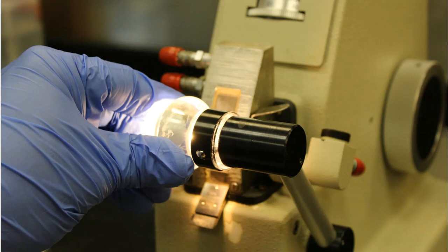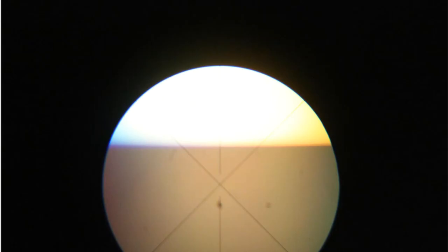So then I look through the eyepiece, and this is what I see through the eyepiece. Okay, so it's kind of off center. I apologize for that, but I think that you can still see the majority of the view that you need to see, because we have a set of crosshairs on here, don't we? I mean, we see this. Look, there's a line, and here's a line, and it makes an X, and X marks the spot. Pretend like you're pirates. So it's going to be my job, because I clearly see the light area up here, and I clearly see the dark area down here.